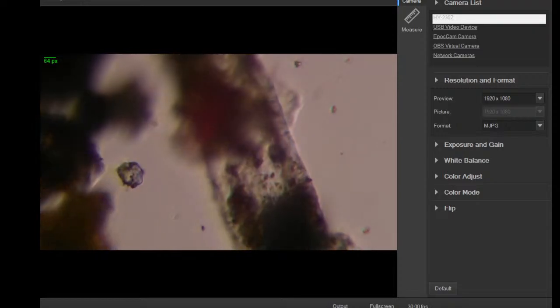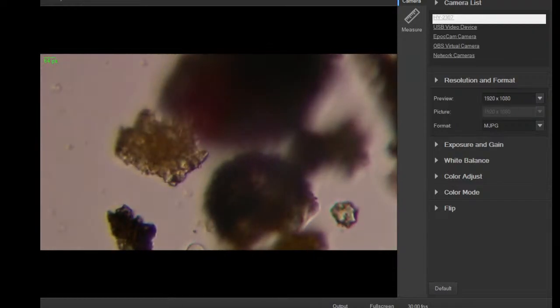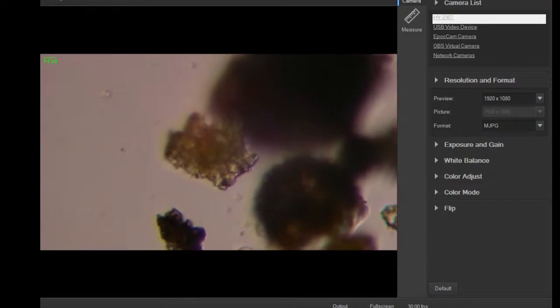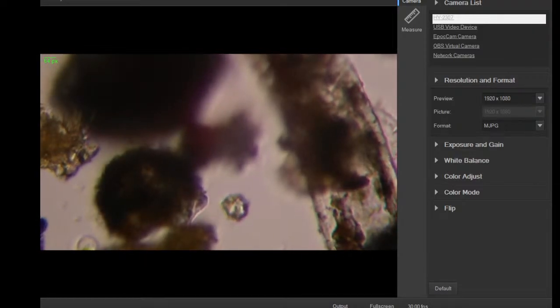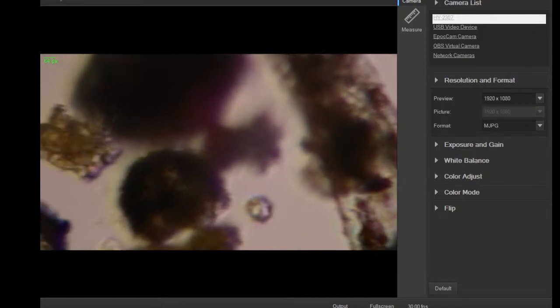Alright, go back to the other window. Alright, where'd you go? Where did you go? Yeah. There's some bacteria down there. So those little wiggly things there by the green. Let me bring it over some more. Some little wiggly bits here by this green. Do they move again? Oh, I have to move.